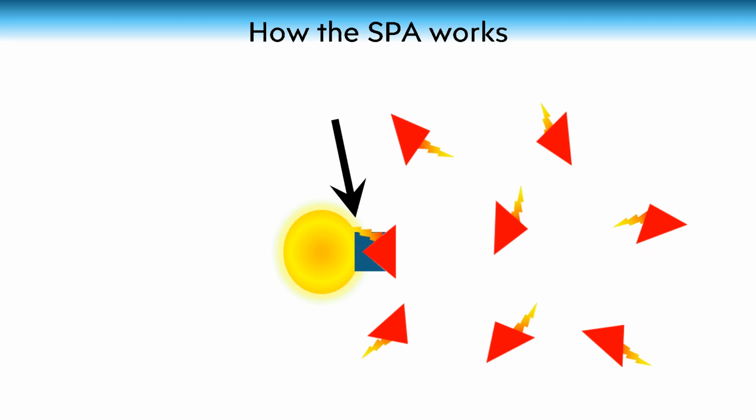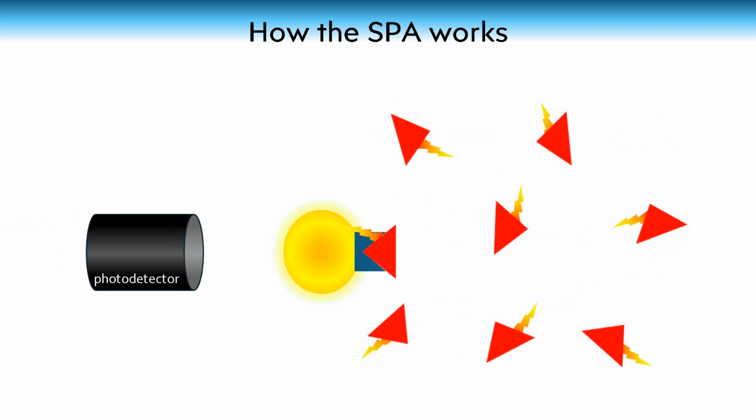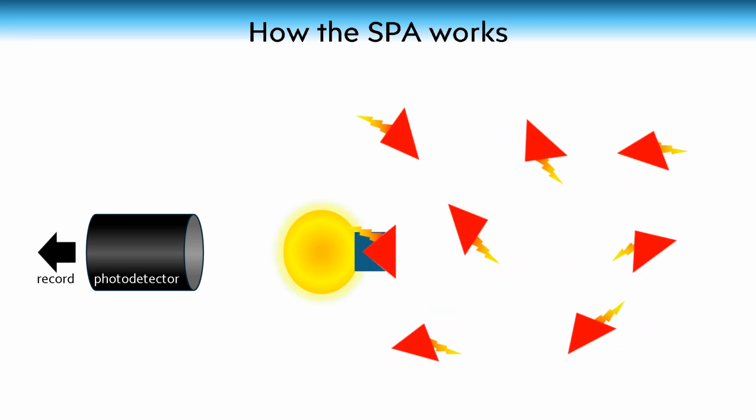The light signal is monitored with a photodetector placed next to the beads. As light hits the detector, it sends out an electrical signal that is proportional to the amount of radioligand bound to the target. The signal is recorded and then analysed.